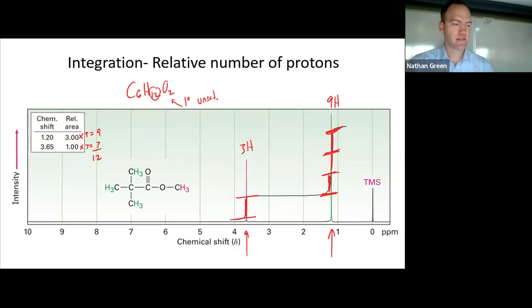Those integration lines, I think, are the most challenging because it's a judgment call about how well they fit in there. But they're actually better than how my professors learned this. So the people who taught me NMR, computers were even worse back then, right? So they had this thing called integration paper. And what they would do is print off their NMR, and then they had a special place where they put on white cotton gloves, and they had very special scissors. They would cut out the peaks of the NMR. They would take them over to an analytical balance, and they would weigh them. So the way that it would work would be like, here's my spectrum.